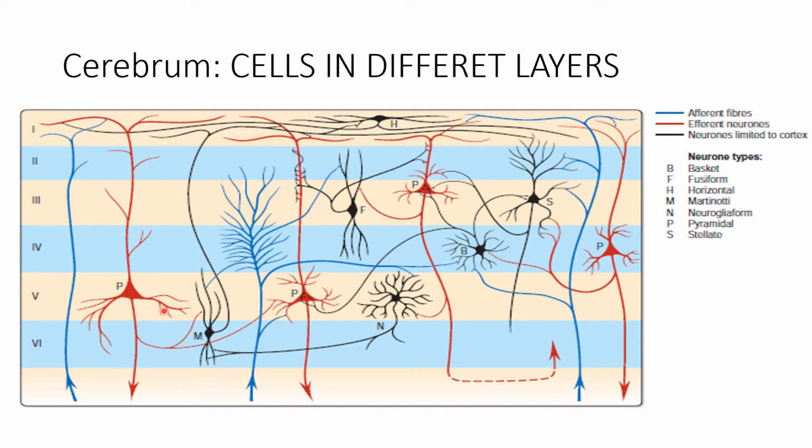These are the large pyramidal cells which are present in the fifth layer of the cerebrum. This layer is also called the ganglionic layer, because of the presence of a larger concentration of the large pyramidal cells. Then we have the cells of Martinotti, which are present in the pleomorphic layer. The axons of these travel to the superficial layer and divide in a T-shaped manner.